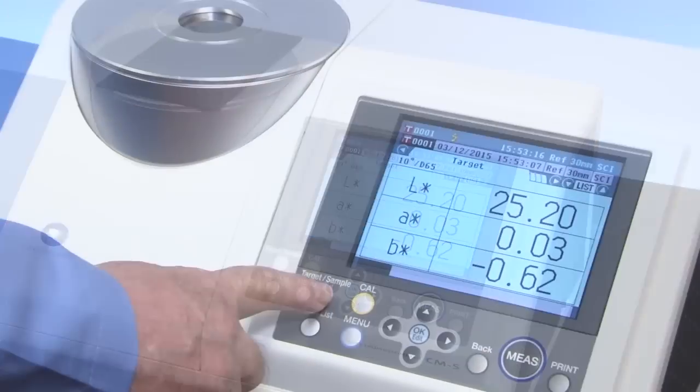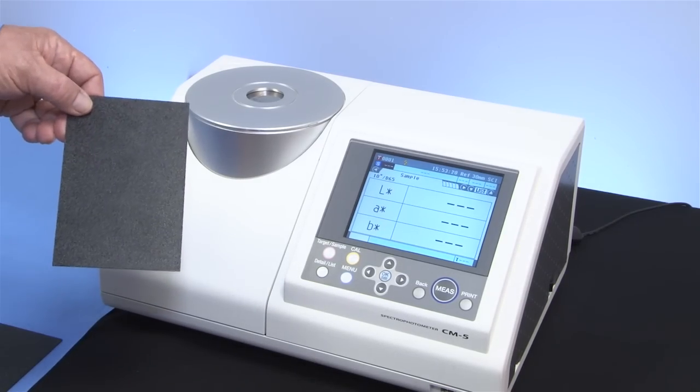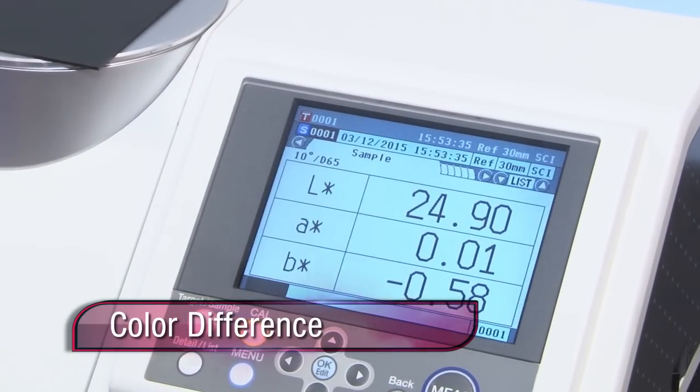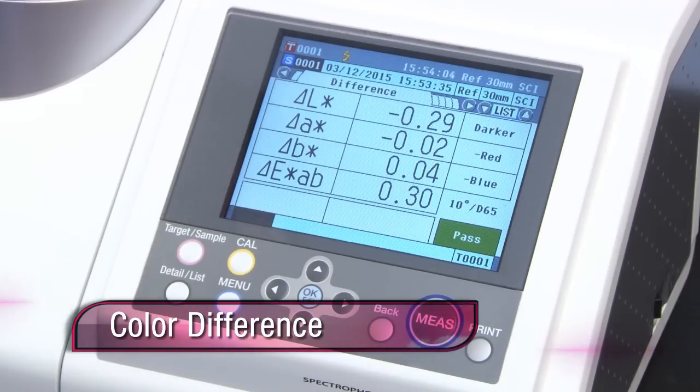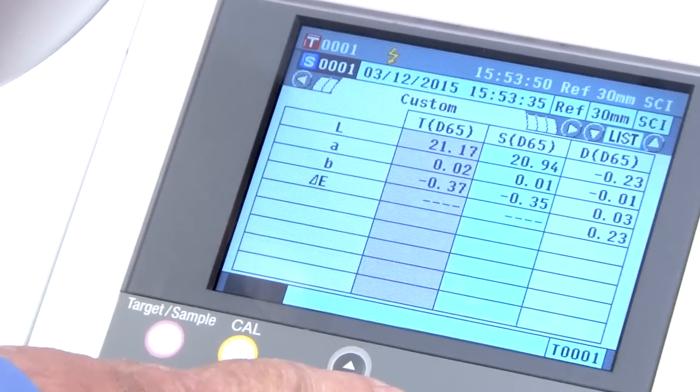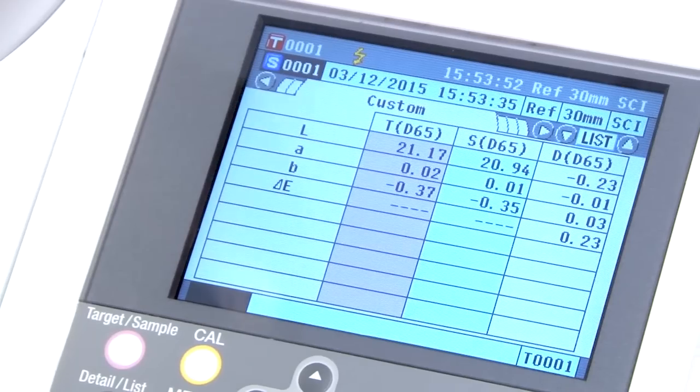For color difference, measure the sample color and the standard color, then save the values for each measurement. The differences between the sample and standard are calculated using the resulting colorimetric values. Differences are shown numerically to identify color inconsistencies between products.